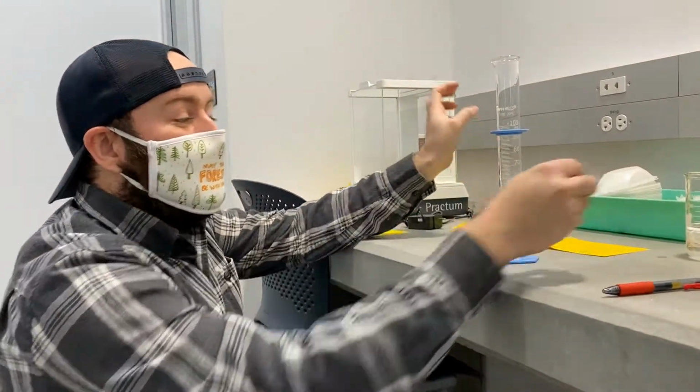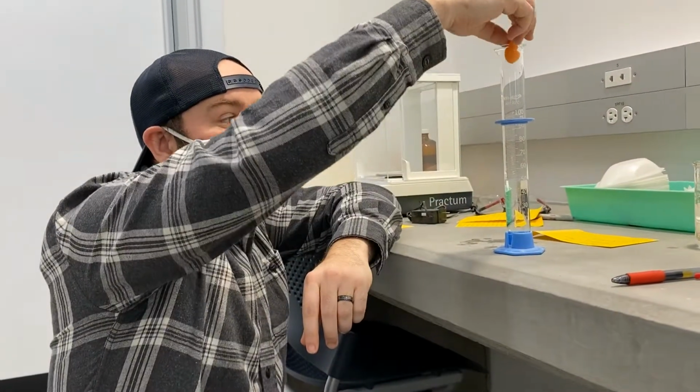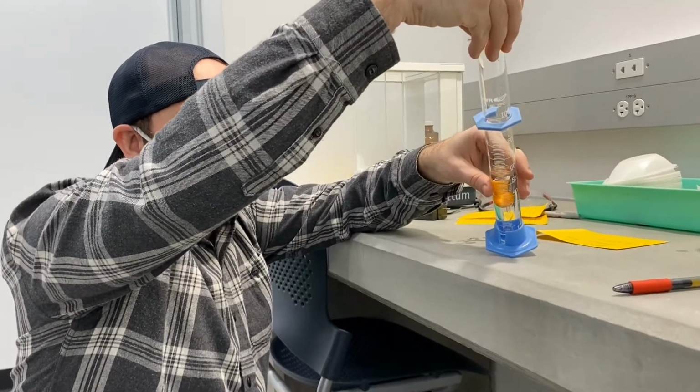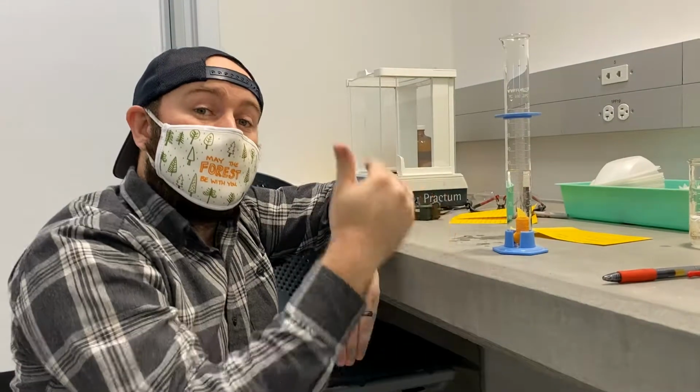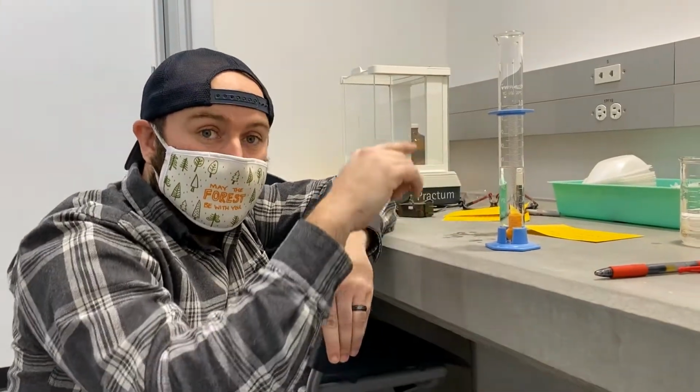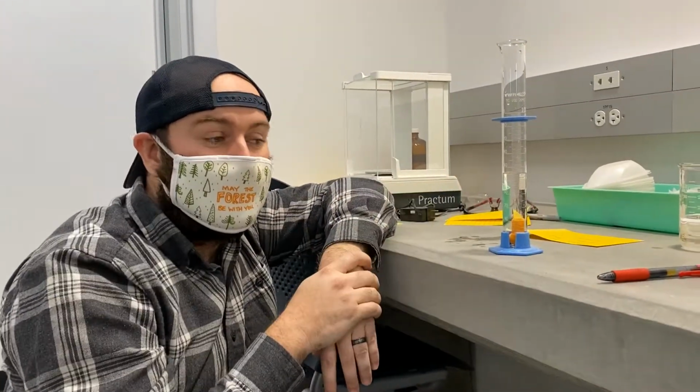Now I'm going to put my little alien guy into the graduated cylinder. I'm going to slide him down so he doesn't splash too much. And now that he's sunk, I'm going to re-record the volume. The change in the volume is the volume of my little alien here.